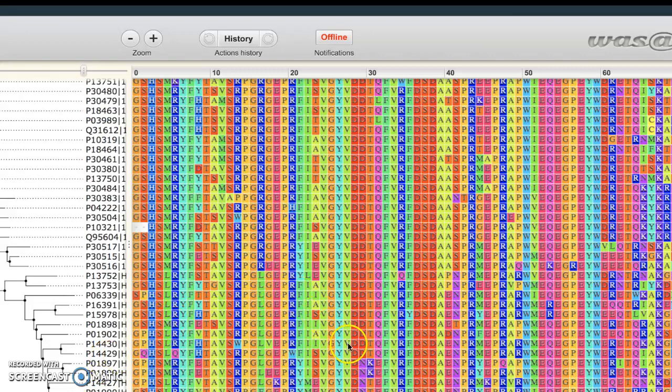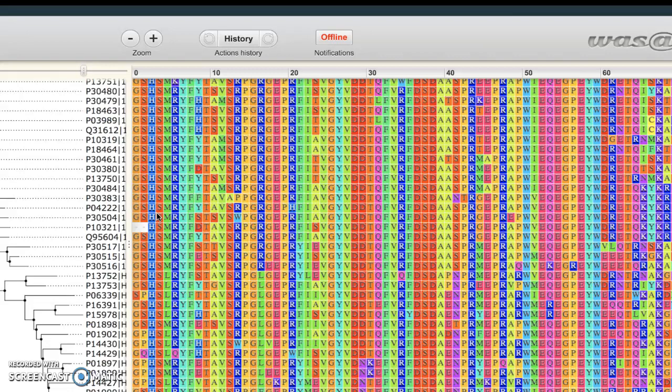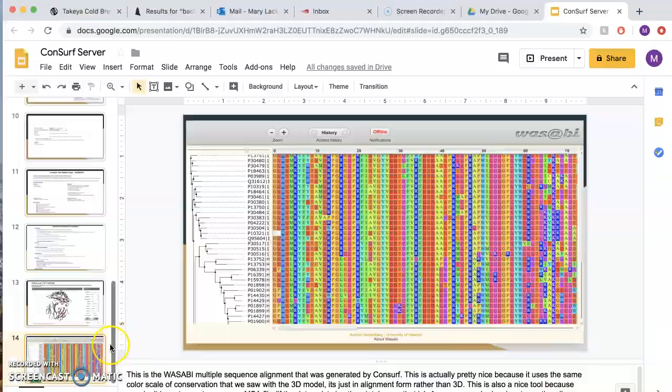This is our Wasabi sheet that was also generated. This is kind of like a coded method to look at the data that was generated by ConSurf. It's just sort of a broken-down way of looking at your genetic code that you are looking for as far as conservation-wise. And that's it, hope this helped you.